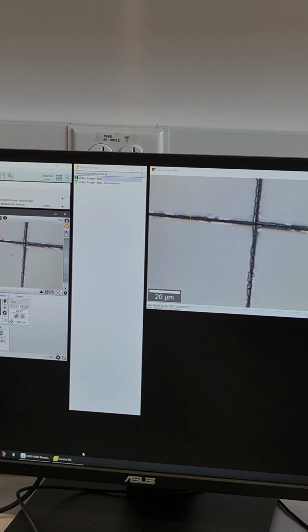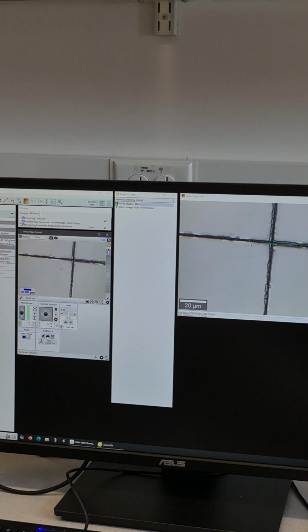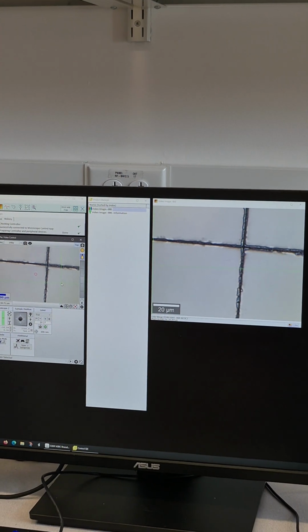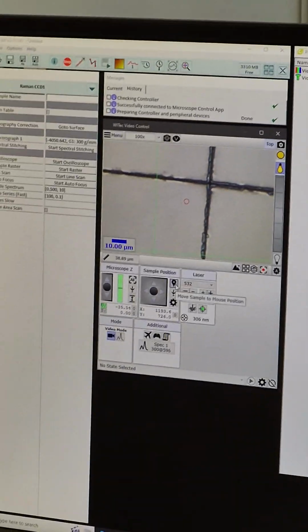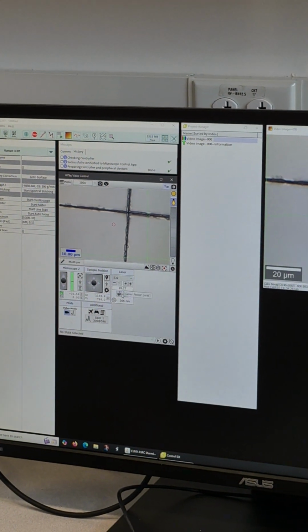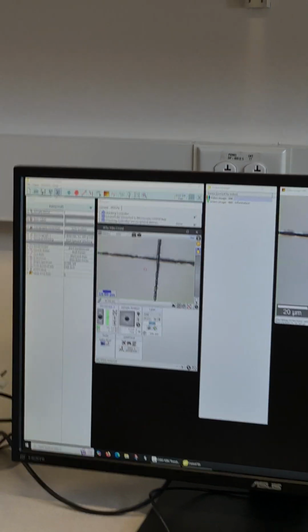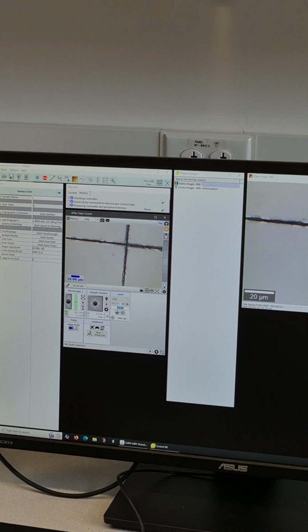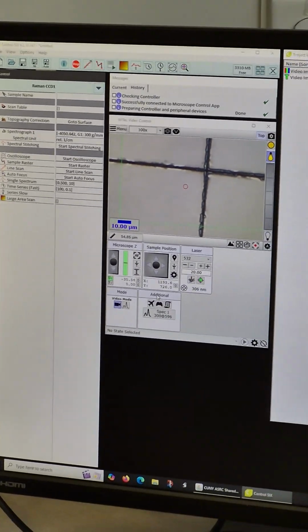Remember to stop it. Why? Because if you keep this on and you accidentally click on the image, or click anywhere in this black while the Raman is taking, it moves. So this is dangerous. You don't use it, you turn it off. And now we are ready for the Raman. So 532, and the laser power, I usually use 20 for the demo sample. And on the control, we used to set up spectrometer parameters over here, but the new software gives it in this additional.